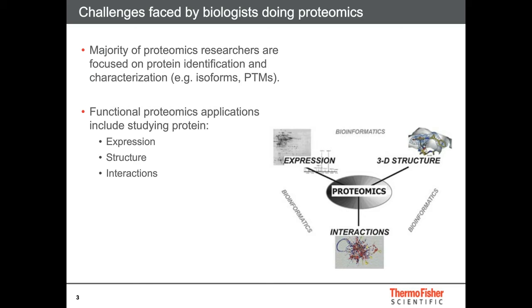Proteins are typically extracted from whole cell lysates using denaturing buffers, which results in loss of information regarding protein localization and protein-protein interactions. Although protein expression data can be inferred from quantifying peptides, this information alone is not sufficient to understand the biological pathways that are active in a cell.